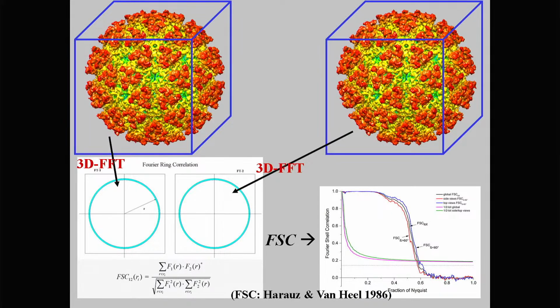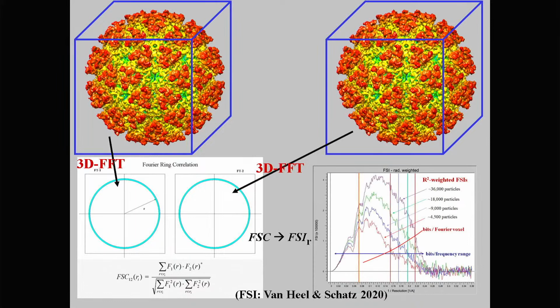So instead of the, this Fourier shell correlation-based half-bit criterion is based on a definition of information by Shannon and his signal-to-noise ratio information, and that itself turned out to be incorrect. So here's where we spread out to more general physics. If you do it correctly, we now have the Fourier shell information that's published here in archives.